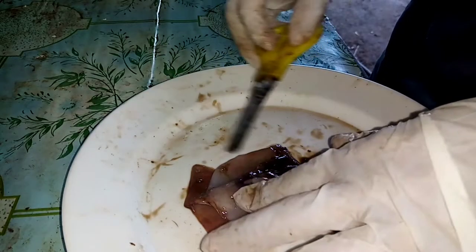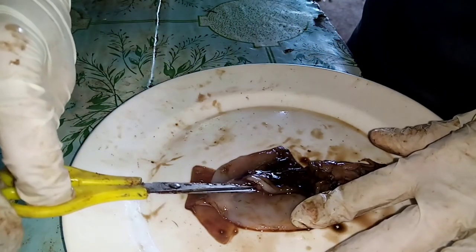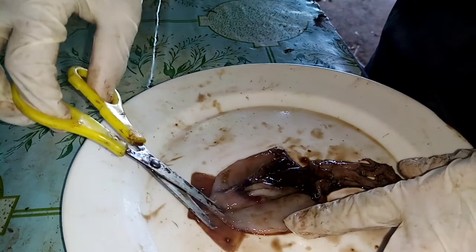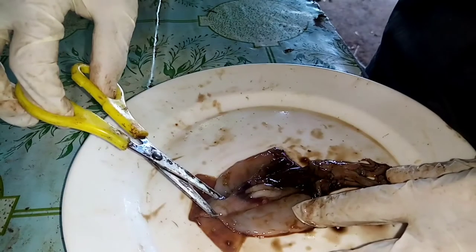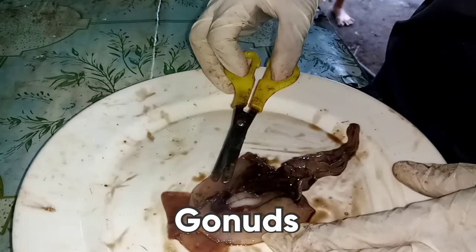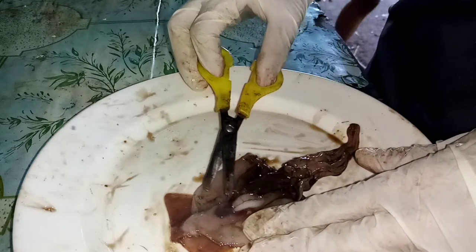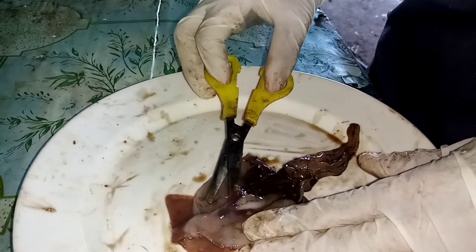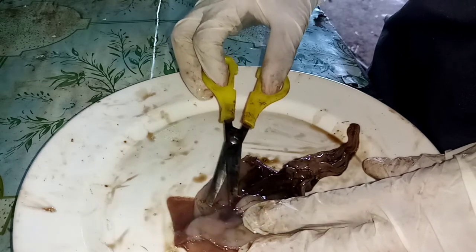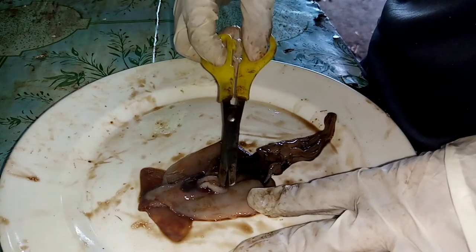So next to the cecum, this part is the nidamental gland. While this one, it is the gonads. Actually, the squid has hearts. So this part, the gonads. The branchial heart. Well, this one, as you can see, is the systemic heart.